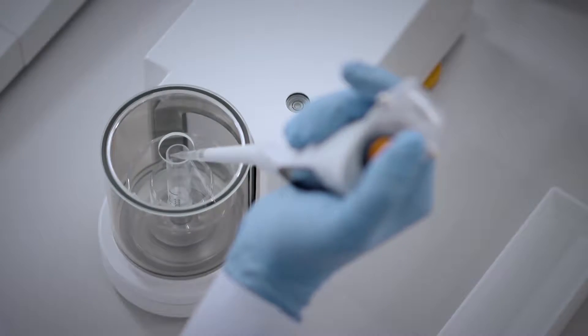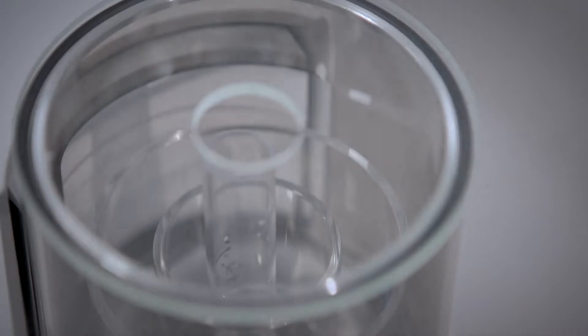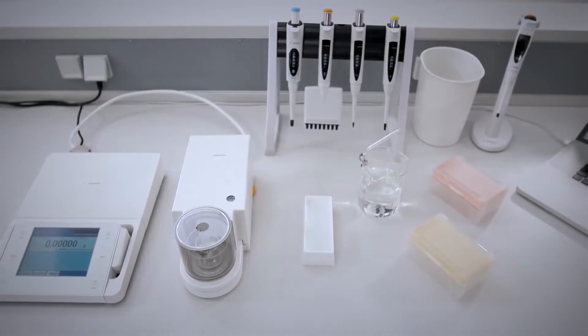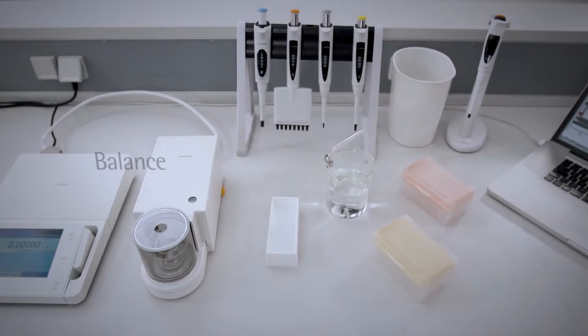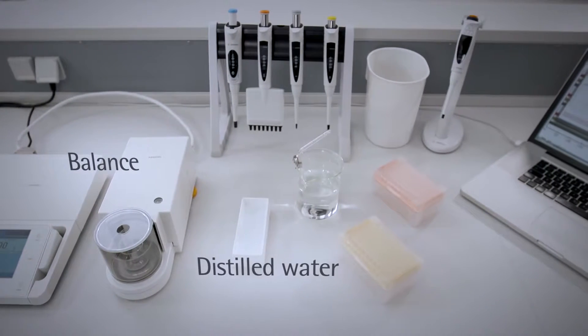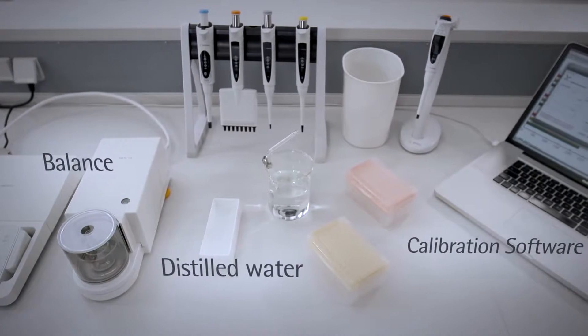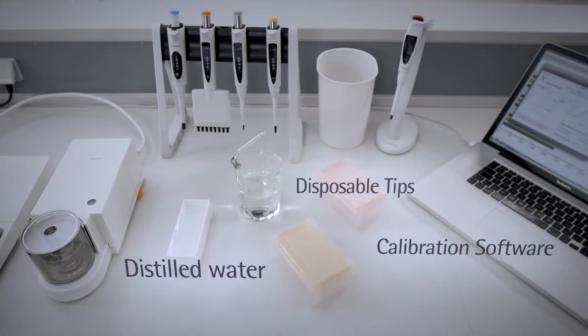One of the key aspects of pipette calibration is equipment. To successfully ensure your pipette's accuracy and precision, you will need a balance, distilled water, calibration software, as well as disposable tips for your pipettes.